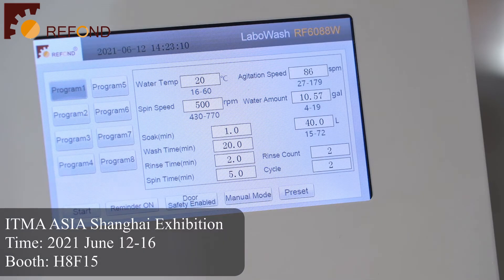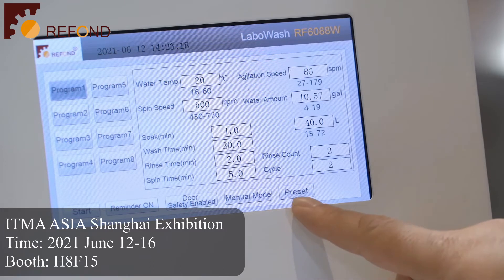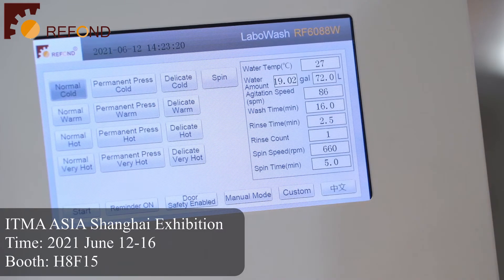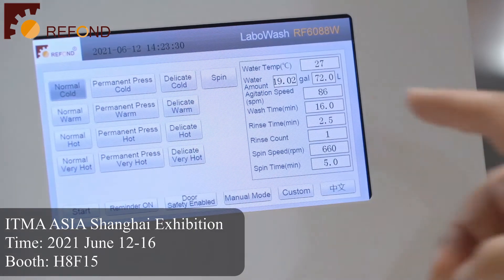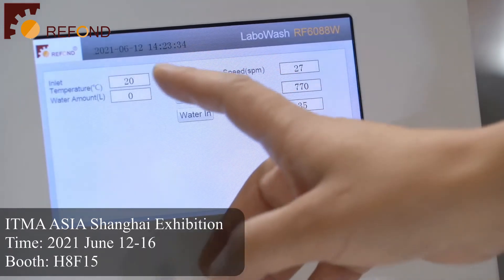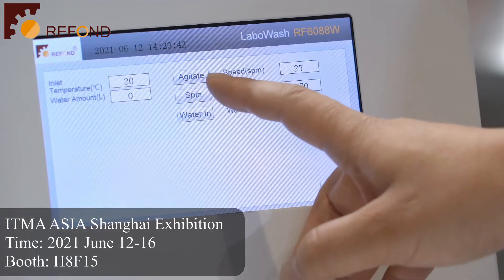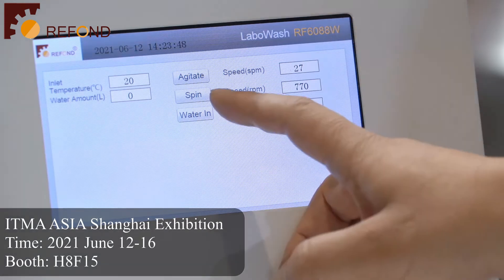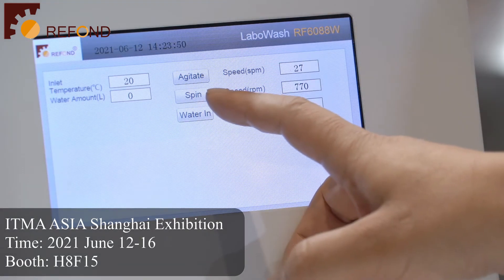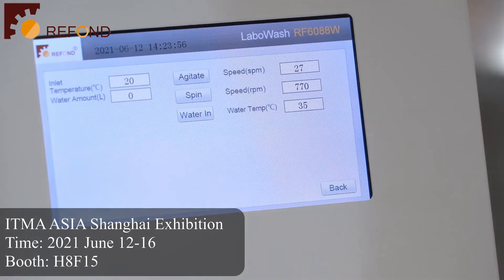The customer can do a lot of their own testing methods. After pressing the preset, they can return to the standard program. Our LaboWash machine also has a manual mode — they can manually control the water input, water temperature, water amount, and agitate the machine at the desired speed. The spin speed and spin action can also be controlled manually.